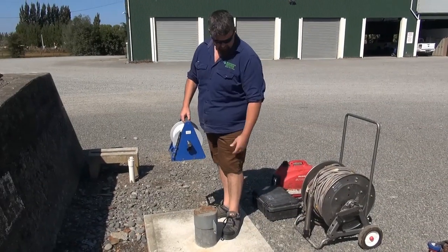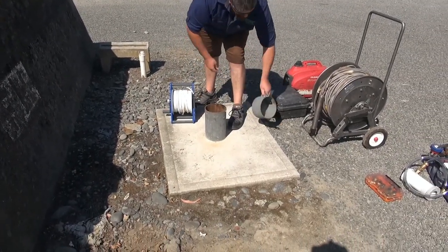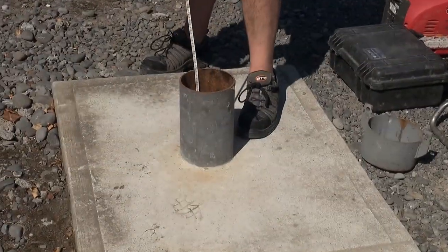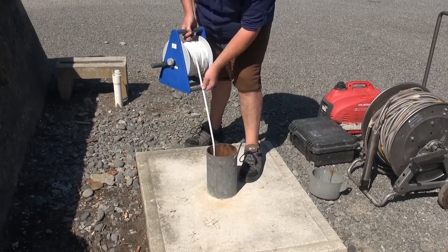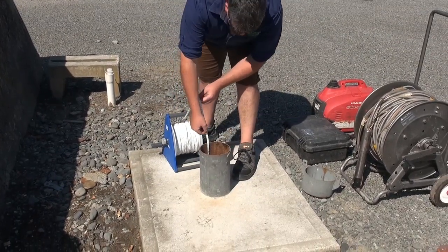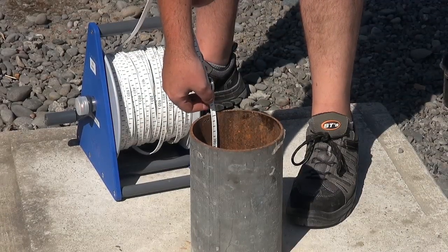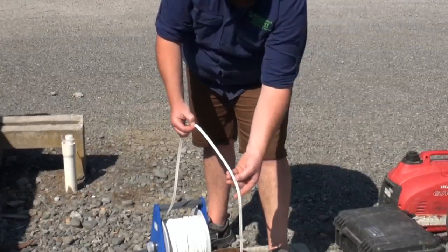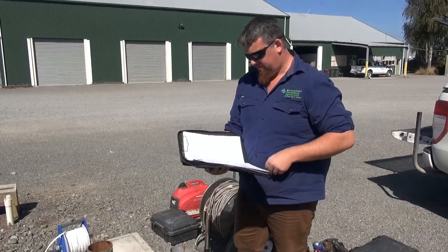So here we have the well — good well head security, nice concrete base, sealed. First step is recording the water level. Lower your dip probe. Whether your dip probe beeps or has a light or a sensor, it's the same deal. Water level there — bring it up, read it: 2.1235, 2.5 metres to water. Record that now before you forget.